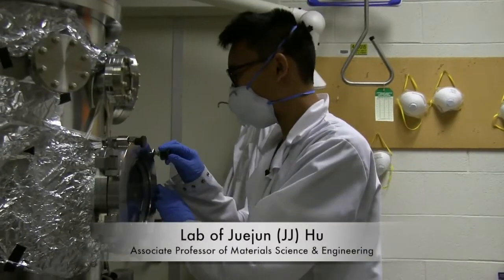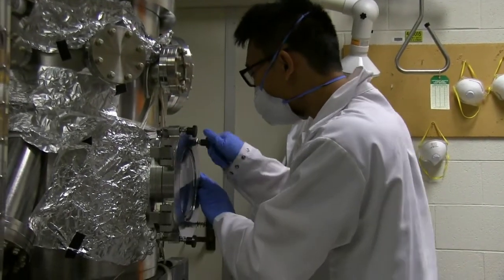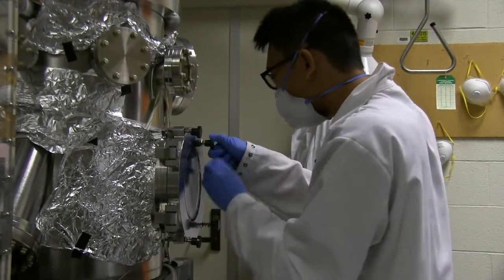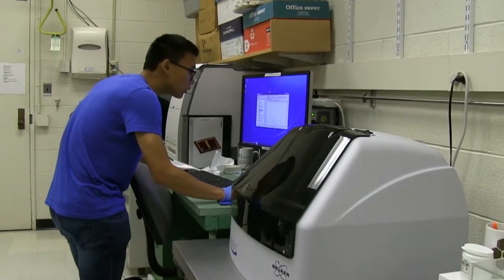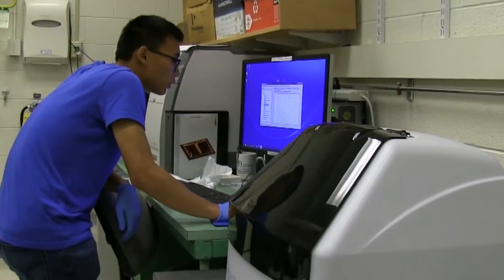Because it's important that the thickness is relatively uniform, we use this machine called the profilometer. Basically what it does is measure the thickness of things.